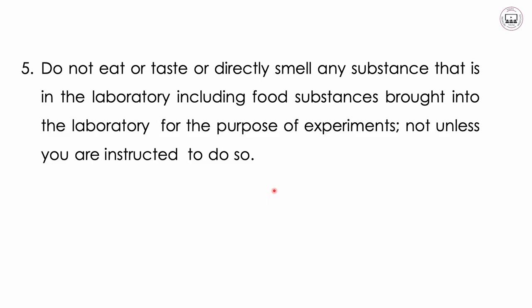You should also understand that when we say do not, it is not only the students who should not eat. Even instructors, teachers, and technicians do not eat in the laboratory. Because we already know, that is why we are saying you should not eat or directly smell any substances that are brought to you in the laboratory.